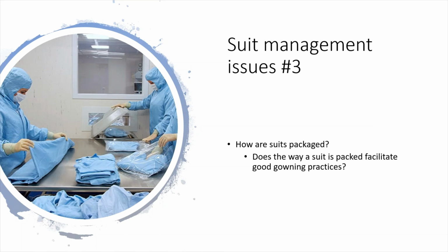Another factor to consider across all types of gowns is the quality of the packaging. So can the packaging survive the sterilisation process? Is it subject to not being affected by wear and tear? And also, what happens when the packet is opened? How has the suit been folded? Do you open it and it falls out and lands on the legs or the arms land on the floor? Or can it be opened in such a way that the operator can keep control of it and avoid arms and legs landing on the floor?